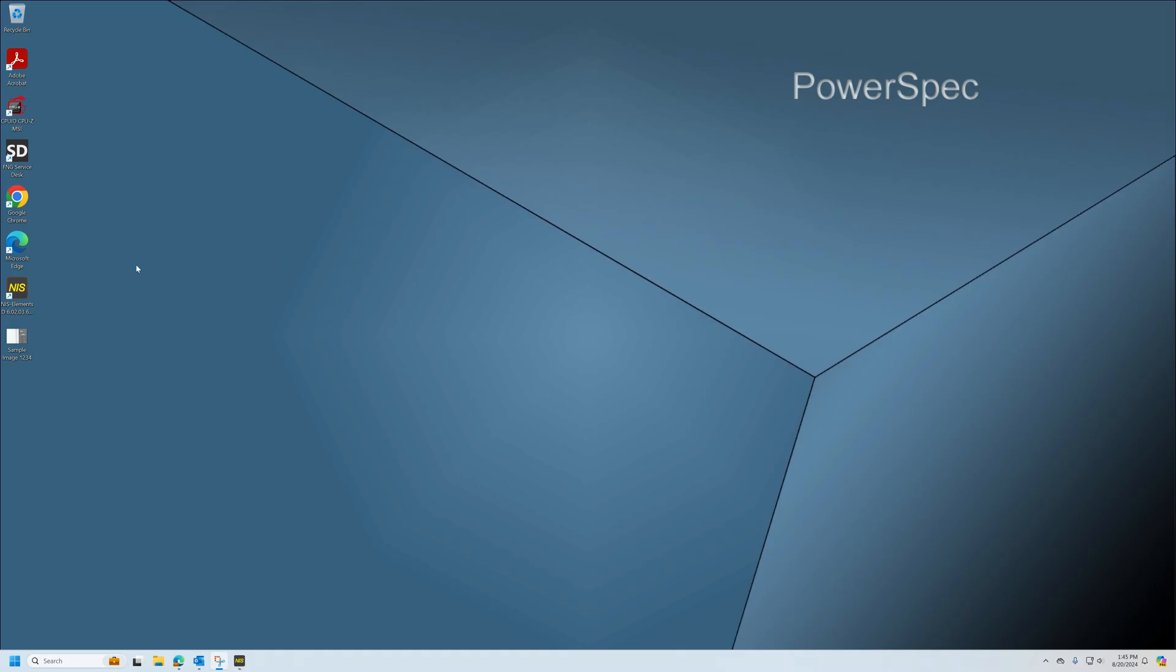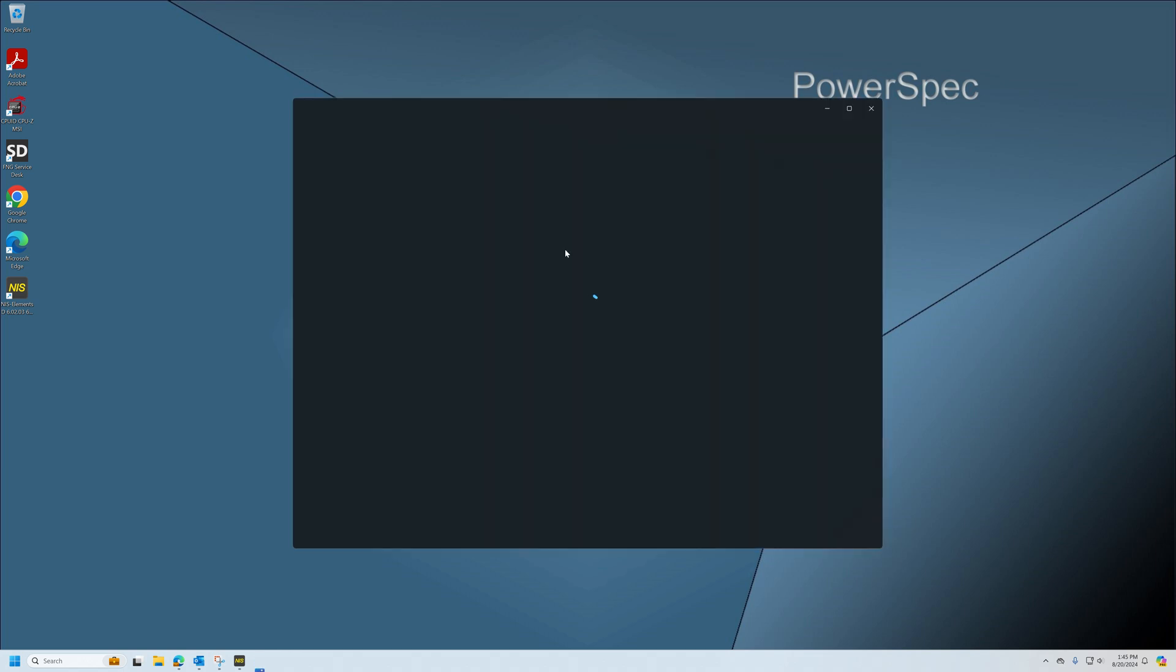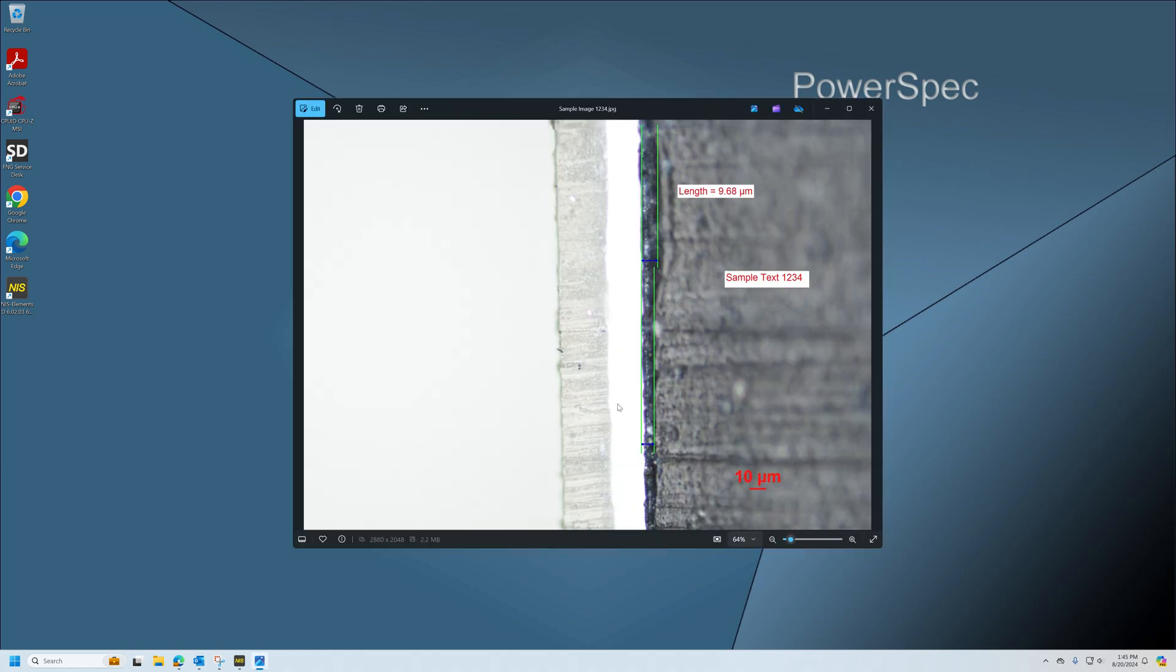Just to show, if I minimize and come out to the desktop where I saved my image, here's my image. Double left click, and then here's the image with the scale bar, text, measurement lines, etc.